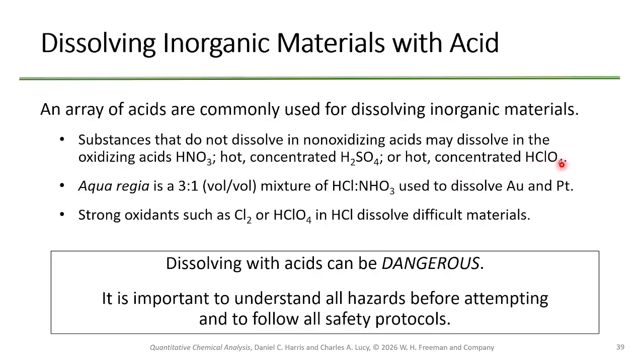Notice this is actually what we were supposed to use for the superconductor. I had to use HCl instead, just because this is kind of dangerous to keep around labs, especially ones where they're going to sit for long periods of time, like where it happens in our labs.